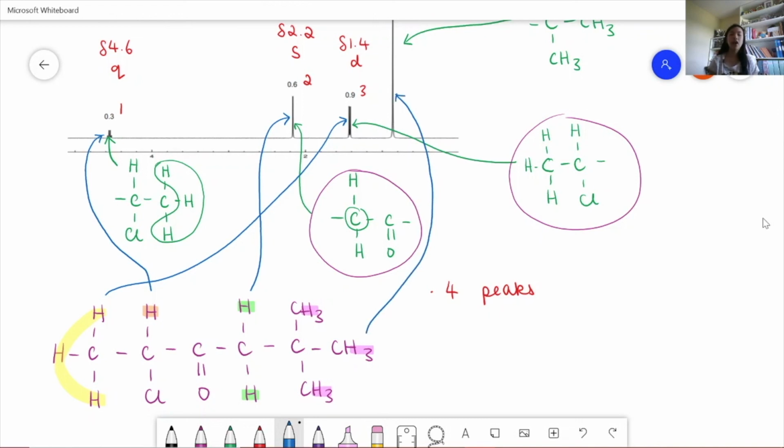So this should get easier once you start doing more and more of these types of questions. But it is quite hard to think of things that could work for the peaks of the spectrum. But just keep trying to work out different sections. So firstly, we look at the ratios, and then maybe write down all of the chemical shift values and what type of peaks they are, and then try and use the table that we looked at of common signals to help you identify if you have sometimes 2 CH2 groups or CH3 CH2 groups.